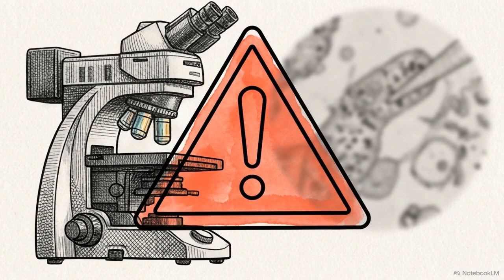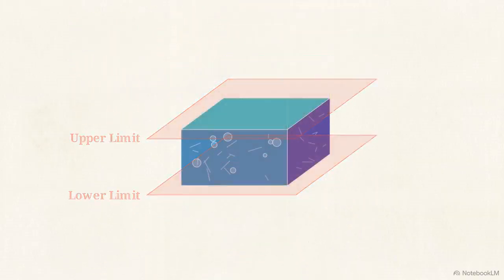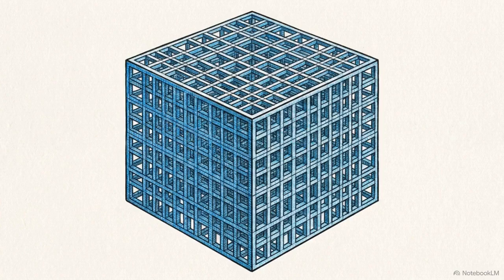Logging inaccurate upper and lower limits here is a primary point of failure. Setting the wrong boundaries causes the software to clip data, leaving you with blurry, truncated sections in the final composite. Defining these precise extreme values dictates the exact spatial canvas the software algorithm will use to build the EFI.